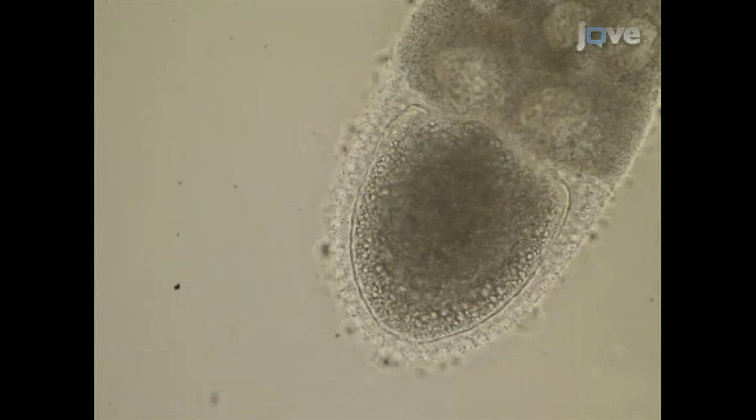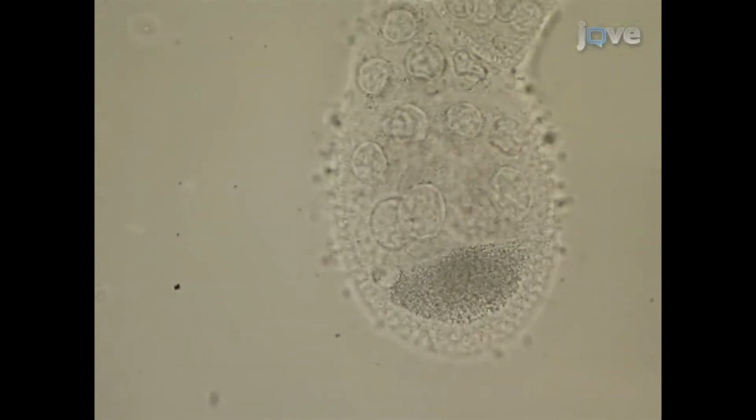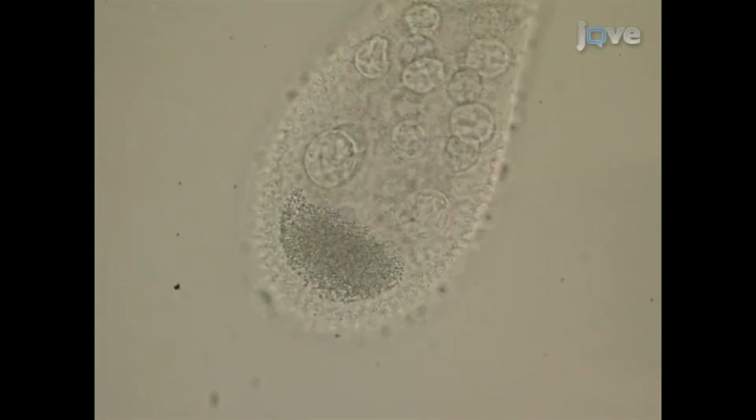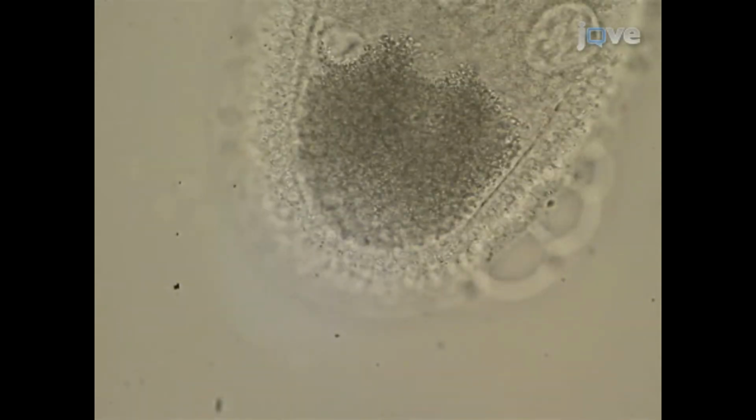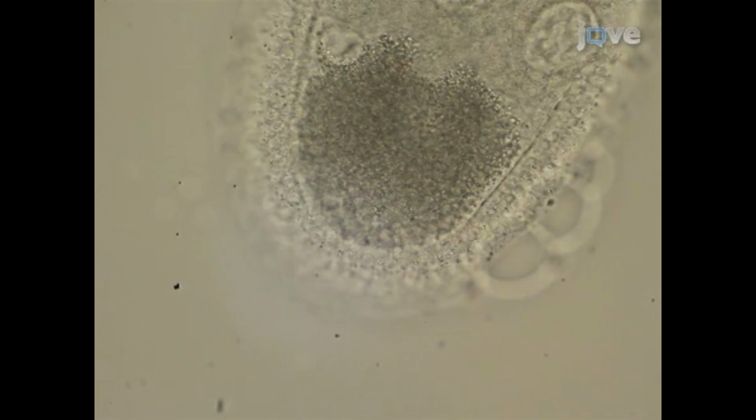If possible, use an automated stage that has point visiting capability to mark all the stage 8 and stage 9 oocytes for injection. Now, lower the injection needle until it touches the oil. Select the first point on the marked points list and focus on the oocyte.